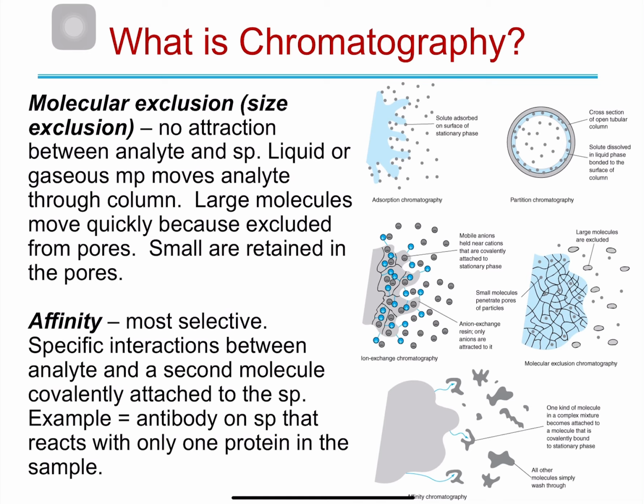Of course, we have to use the proper type depending on the type of sample we have. Here we can use liquid or gas as a mobile phase, because it mostly depends on retention of your molecules in the pores. So gases can easily push away the larger molecules. So we can use either liquid or gas as our mobile phase.